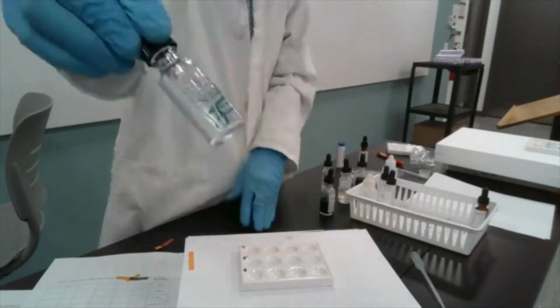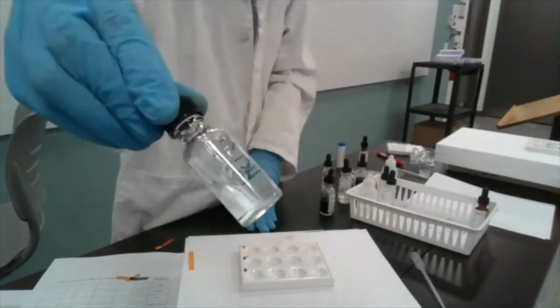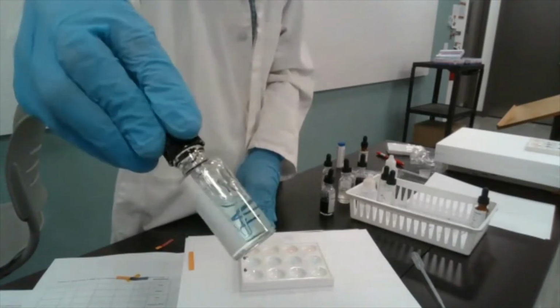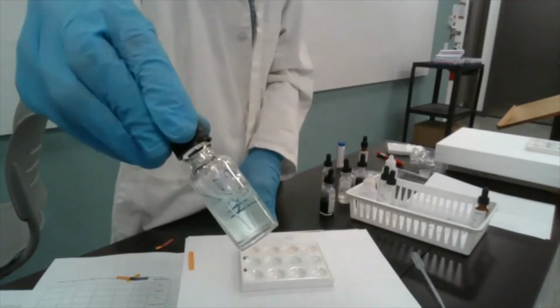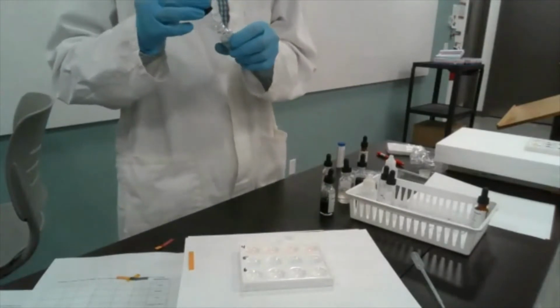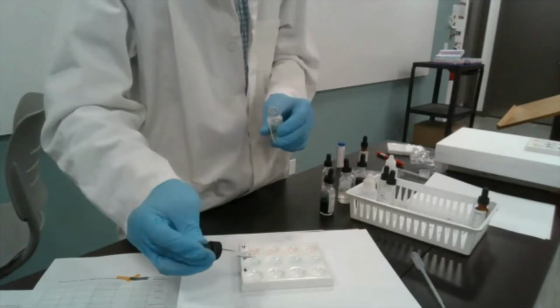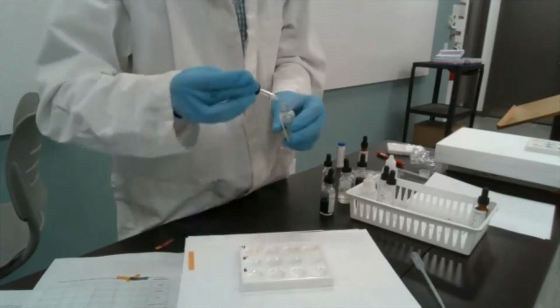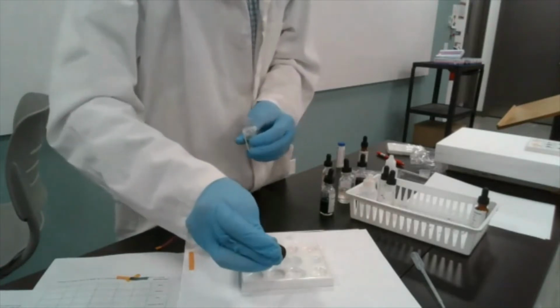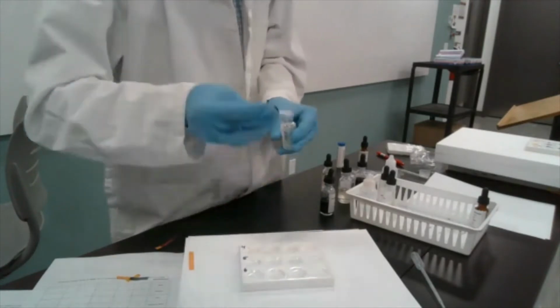And soap solution, again, just your typical hand soap, not the maybe aggressive shop type industrial soap, just one of those greenish soaps that you may have sitting on your sink. I added some water so it's not as thick, right? So it mixes easily with the indicators, but it shouldn't change the chemical properties significantly.